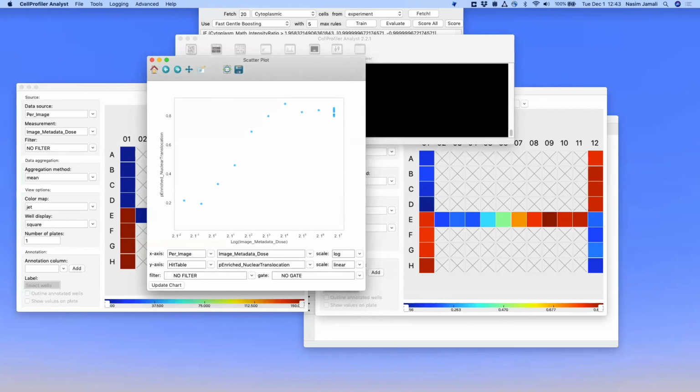All good? Any questions here? You see, we answered the question that we started with, or wanted to answer. See how fun it is to work with Analyst. I love Analyst. That's very, very cool.